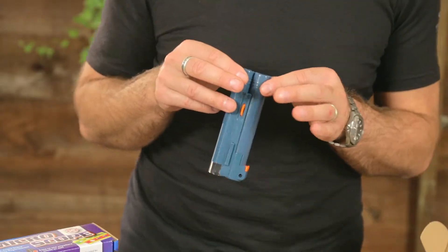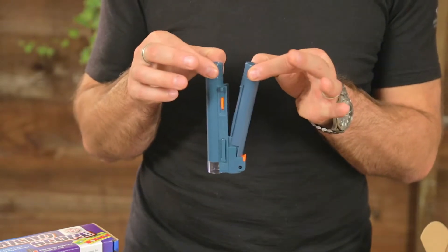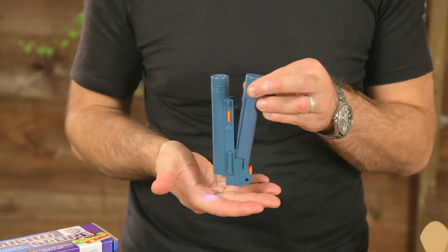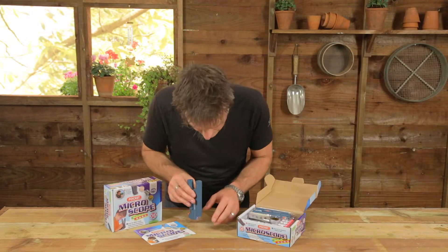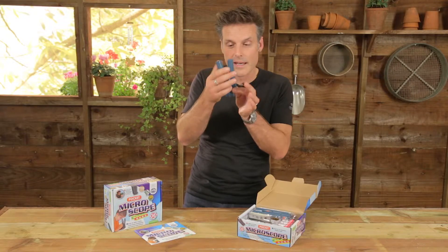There it is — it's a thirty times magnification, that's pretty high. It illuminates; you pull this lever out here and it lights up, and you simply then find something of interest, whether it's the dirt under your fingernail or a small insect or anything like that, and you just focus it with that little wheel there.